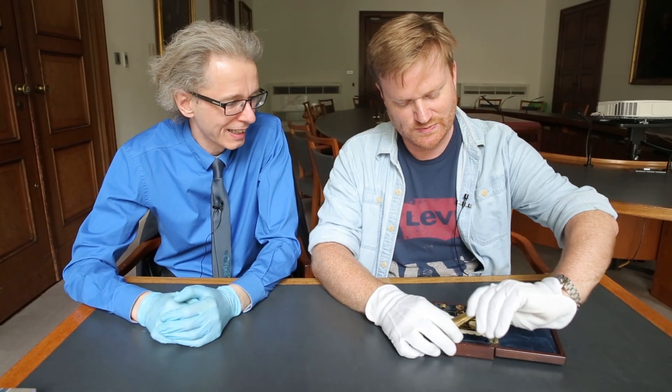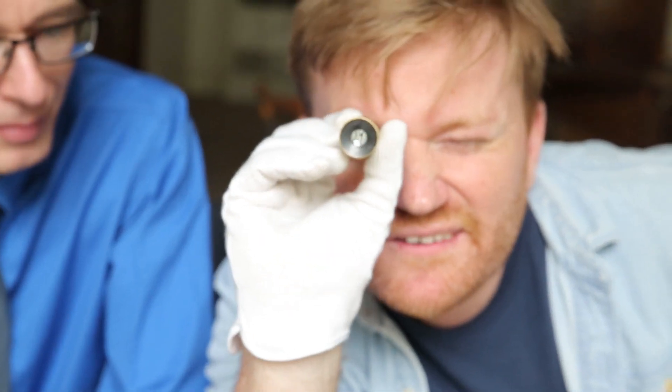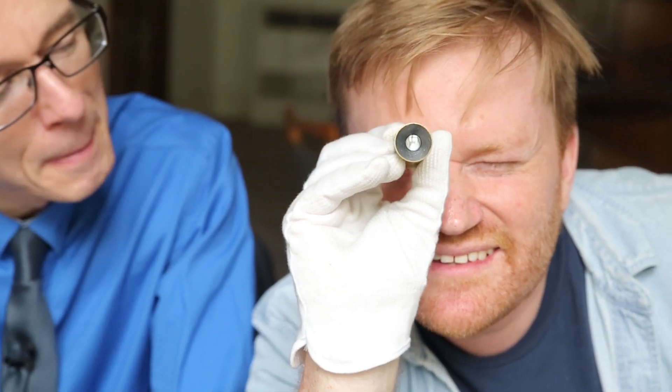Let's have a look at some of these bits. Well that looks like the main body, doesn't it? Look at that. It still works. It works, yeah. That's the great thing about things like this. That's really cool.